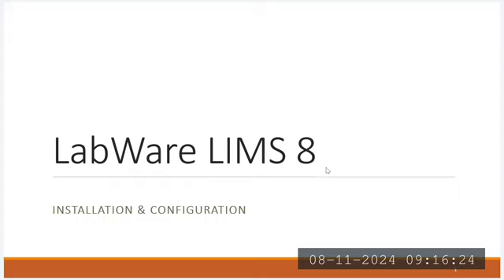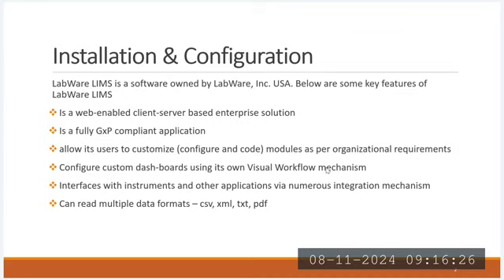As part of the installation activity, what needs to be ensured: whether you want to maintain a web-based application or a desktop, client-based application, how customization and configurations will happen, whether you want to interface with instruments or not, and whether it can read multiple data formats as part of instrument integrations, like CSV files, XML files, text files, PDF files. Multiple types of files will be available, and how can we manage such types of files.